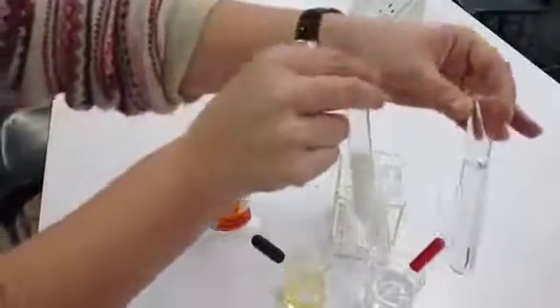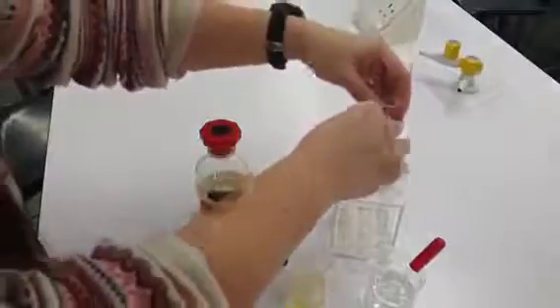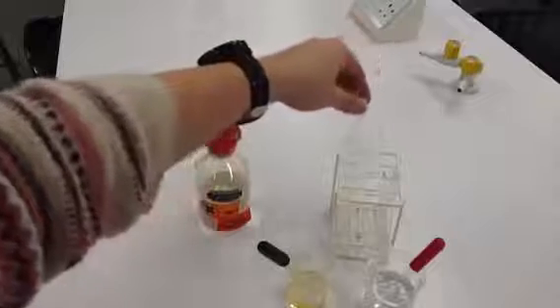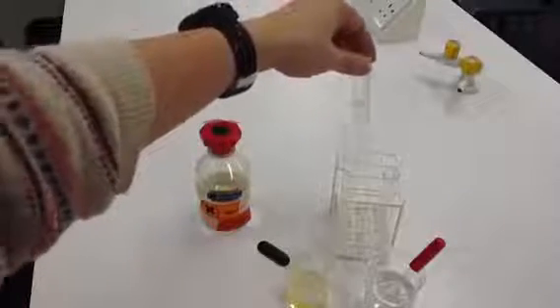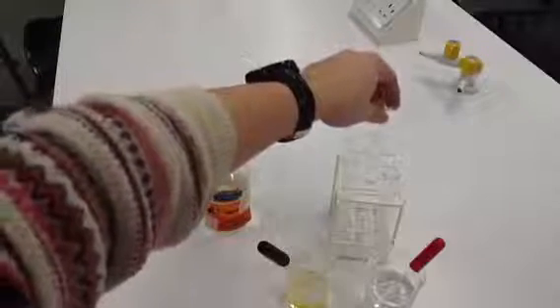So just comparing tube A with tube B, you can see tube A has a milky emulsion and tube B doesn't. So this is indicating that sample A did in fact contain lipid because it turned into this milky emulsion, whereas sample B stayed quite clear. It didn't convert into a milky emulsion, indicating that lipid is not present in this sample.